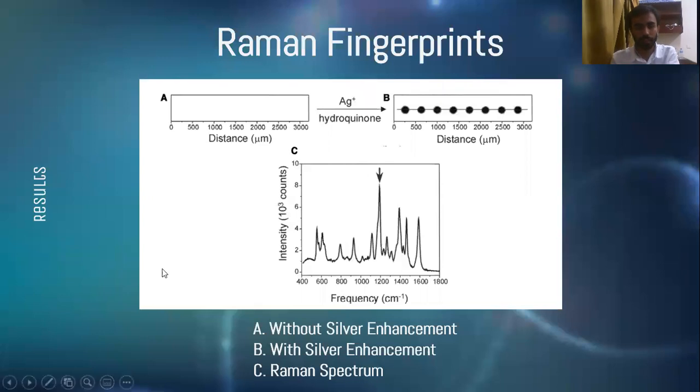So here we have the spectrum that is obtained after this whole result, and let me go through the whole diagram in sequence.